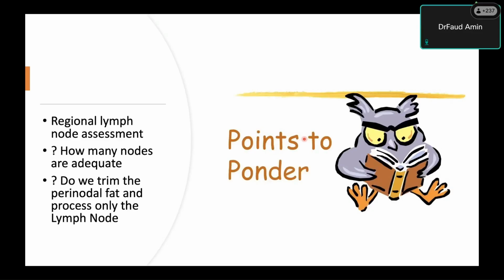Invasion might be there. In the perinodal fat, there might be invasion. So perinodal extension. Yes, ma'am. Okay. There might be invasion. Yes, so perinodal extension. So to document perinodal extension, we should never trim away the perinodal fat.